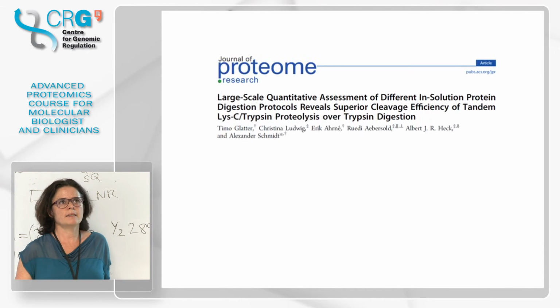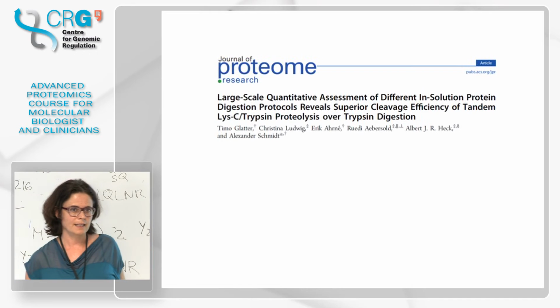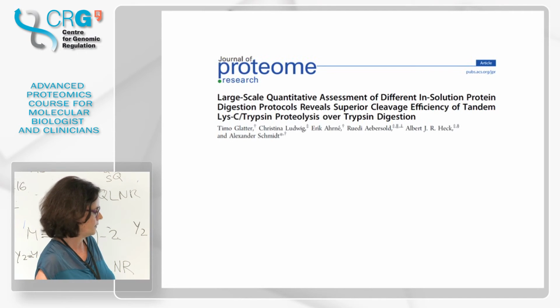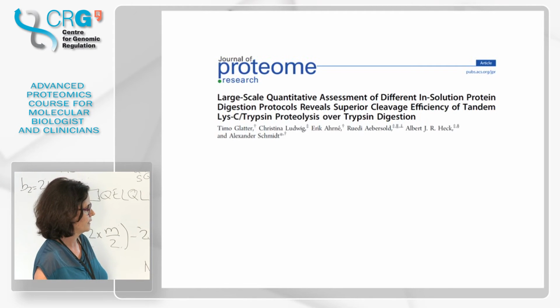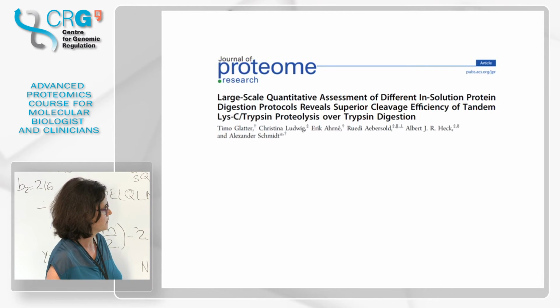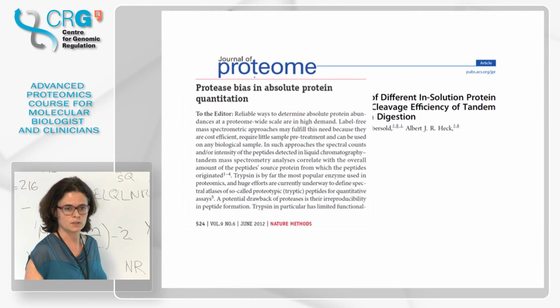So it seems a minor subject, no? This thing of the digestion, it's easy. But there is a lot of work on digestions, even by very important people like Rudi Aebersold and Albert Heck. They have been publishing papers in the last 2 or 3 years talking about the digestion process.